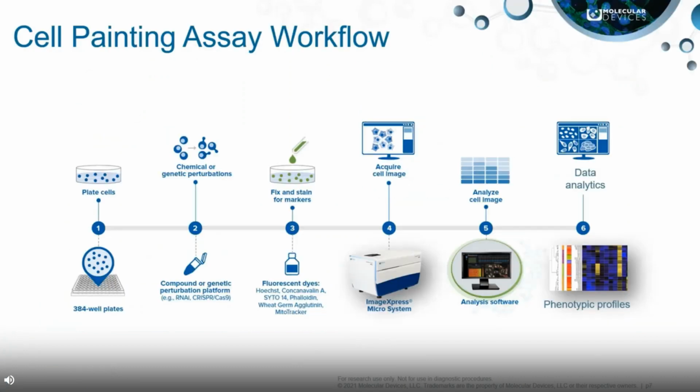And so let's say, for example, that in the last couple of slides, I've gotten everyone in the audience very excited about cell painting and you just want to get started. So how does one go about carrying out cell painting? So in a standard cell painting assay, cells are perturbed using chemical or genetic approaches. They are then fixed, stained, and imaged on a high-content imager. So that's step 1 all the way through 4. And then this is followed by image analysis, step 5 here, and then with some data analysis involved.